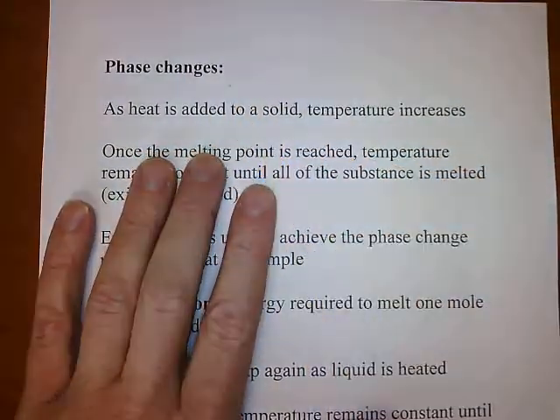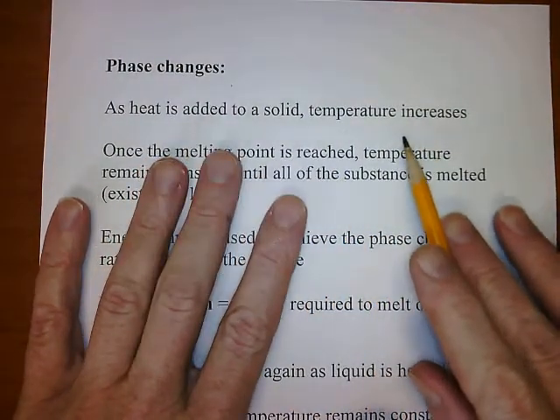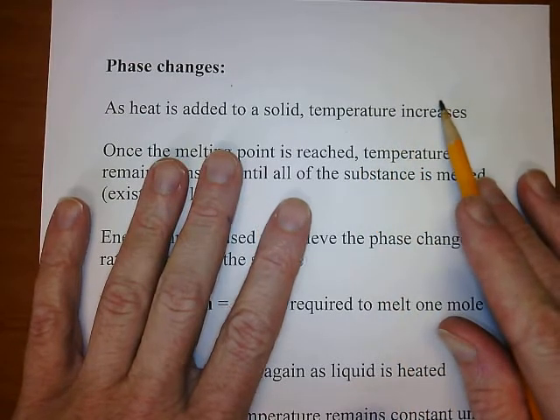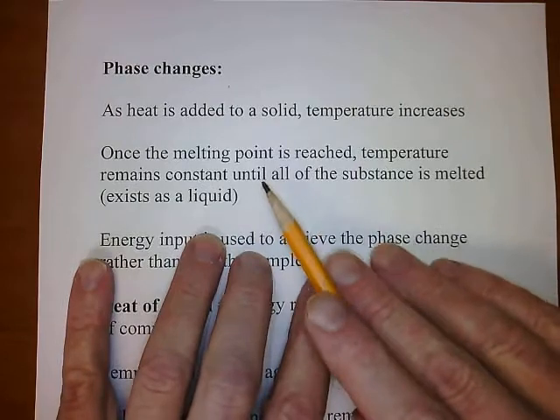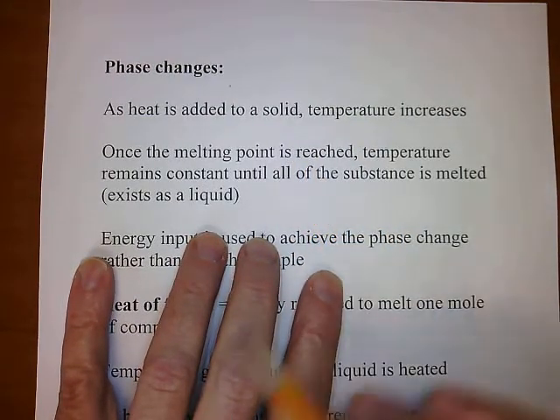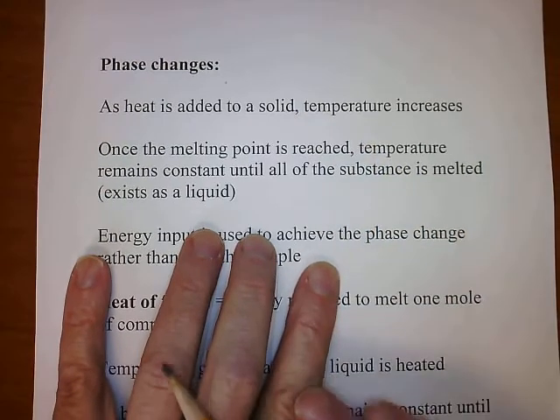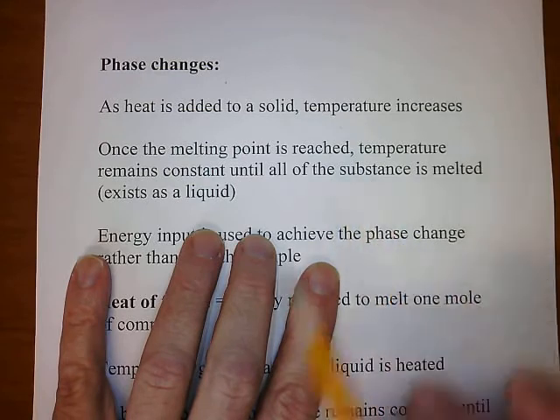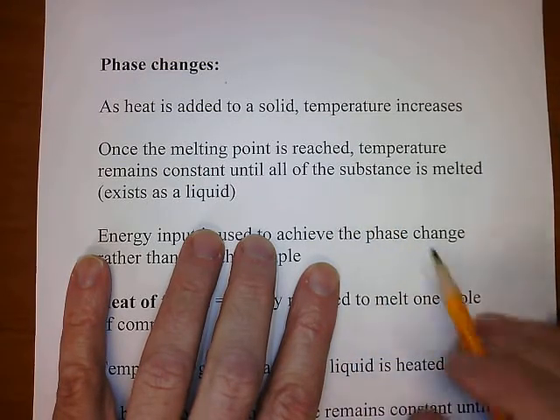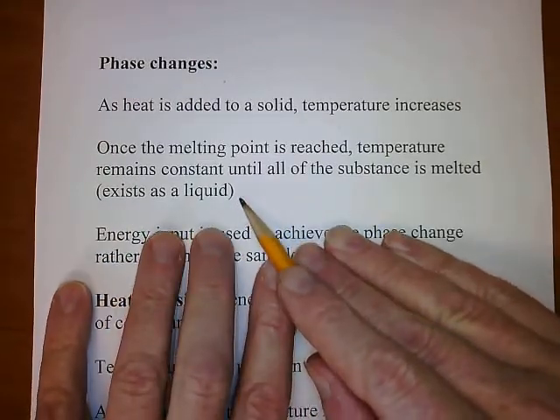If you take a solid and you heat it, the temperature will increase steadily until you get to the melting point. Once you get to the melting point, your temperature will level out and remain constant while the phase change is taking place until all of the substance is melted. In other words, until all of it exists as a liquid.